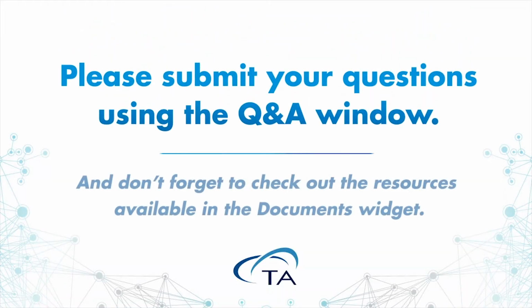All right, thanks. So we had a few questions that came in, and I'm going to go ahead and start with this first one. This is a question on how the drug load was quantified. In the webinar, I presented a low, medium, high load. This was actually done not by me, but by collaborators at Waters Corporation. If you're looking for the reference, it's in mAbs Volume 7 from 2015, Birdsall et al. They're the ones that actually quantified via mass spectrometry what the actual drug loads were.